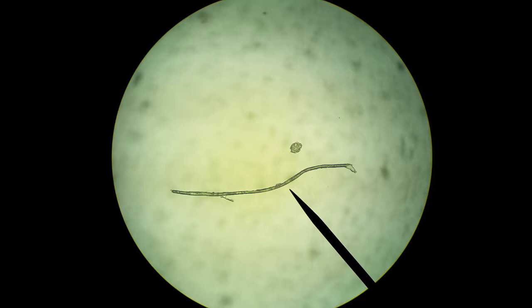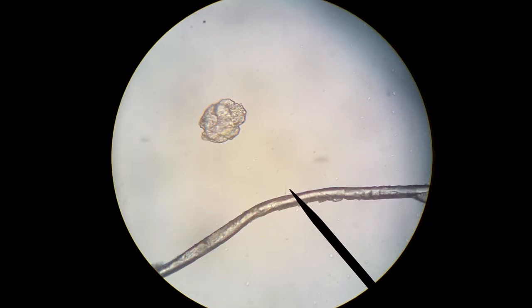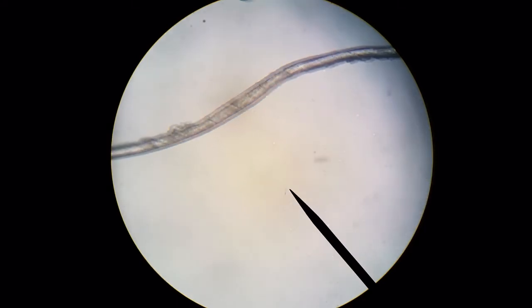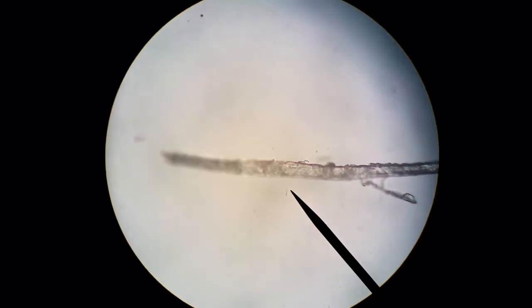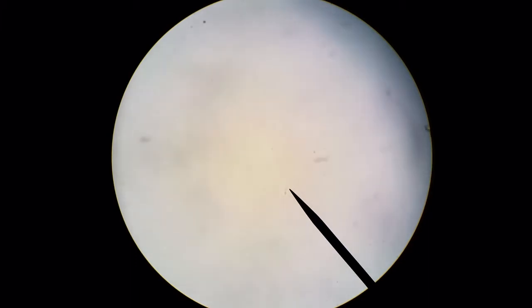Is this just a bit of root matter, or is this a chopped-off piece of fungi? It looks a little bit too big to be fungi. Going to our highest magnification — the 40x brings us to 400x total. We have a filament here, and I cannot distinguish any cell walls.